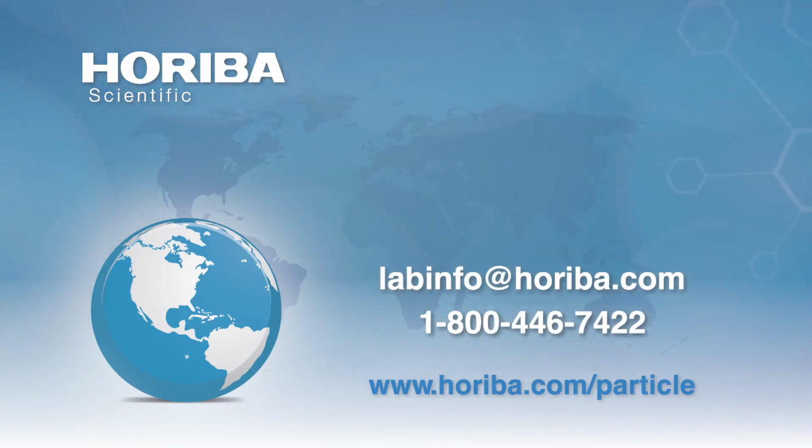Next question. Have you ever measured zeta potential of water-based epoxy emulsions? Water-based epoxies used for making things like fiberglass? Well, the answer to that one is yes. And the point about it is, once again, anything like that, even cationic resins are used. The fact is, if you take those materials and you titrate them as a function of pH, if there's any surface functionality, zeta potential will pick it up, okay?